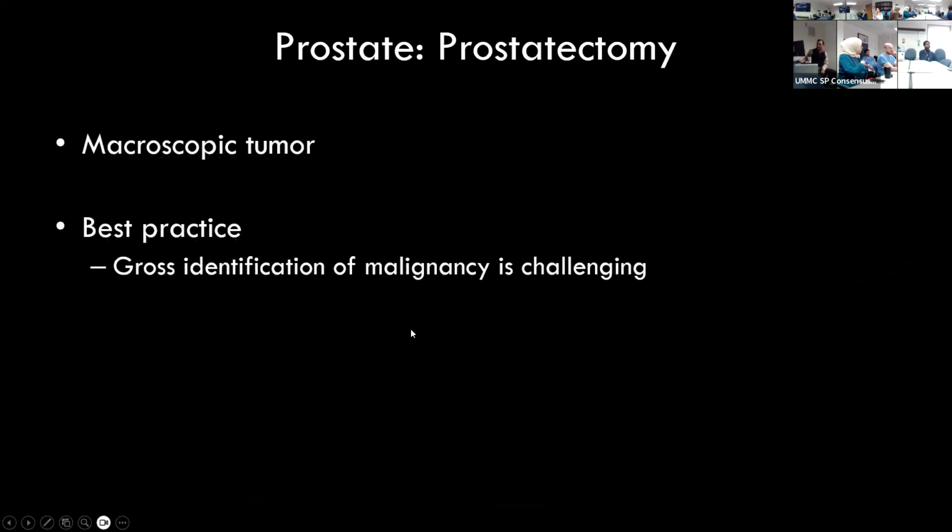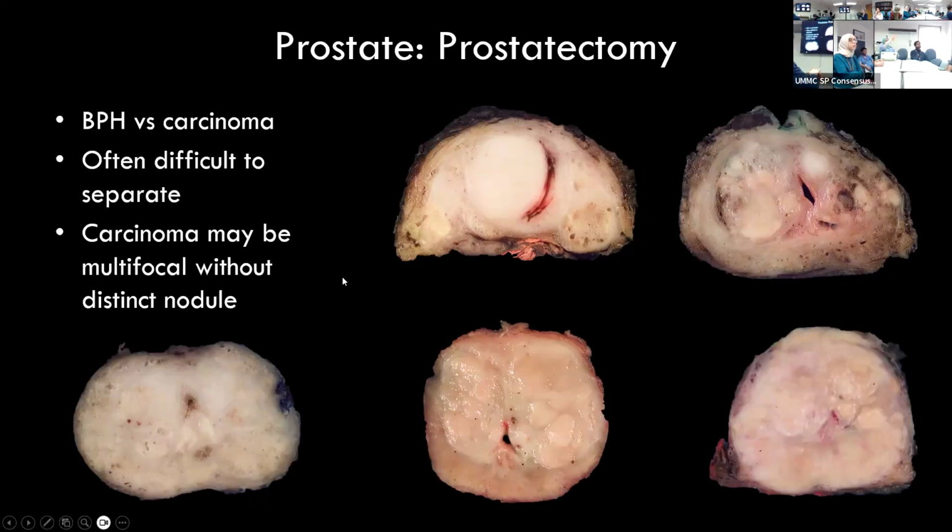Dr. Murugan, I have a question on the previous slide, the picture, you can go back one slide. The picture at the very top, the one that you said is BPH, but this also, yeah, cancer, no, the one next to it. This one? Yes. If I see something like this, should I count it as one big nodule, or what can we do if there's a change in color, so that it's described as two and not one, because the BPH part is within the same nodule?